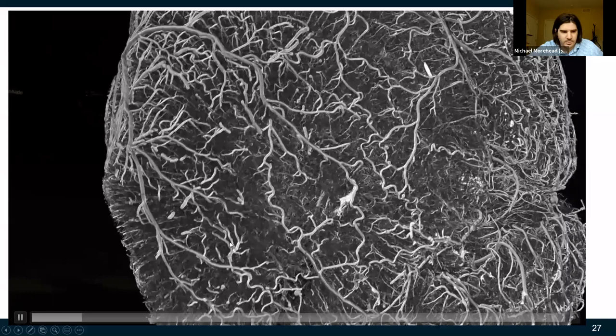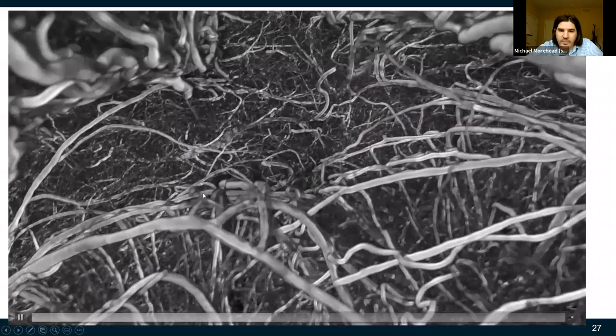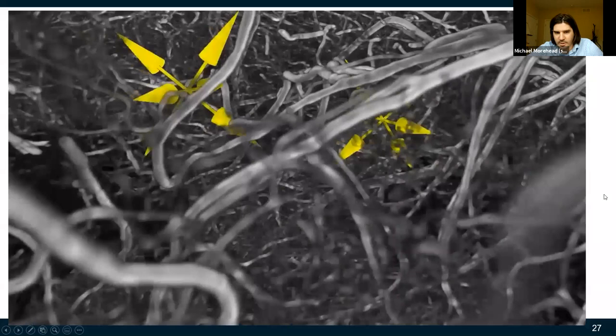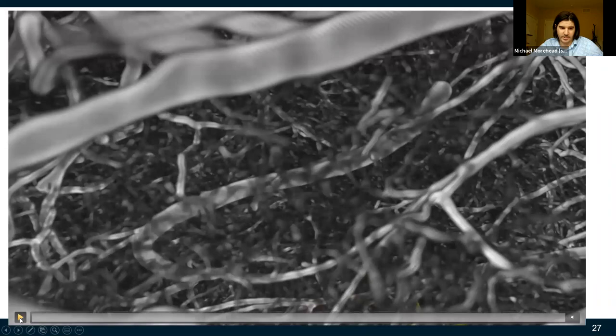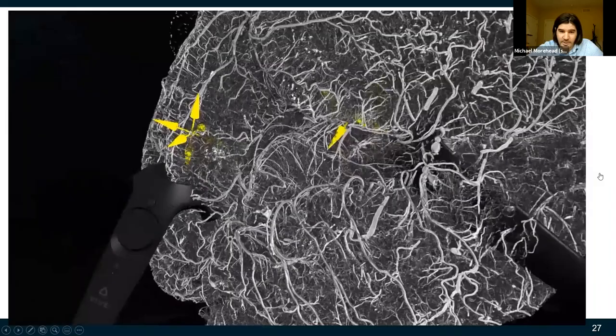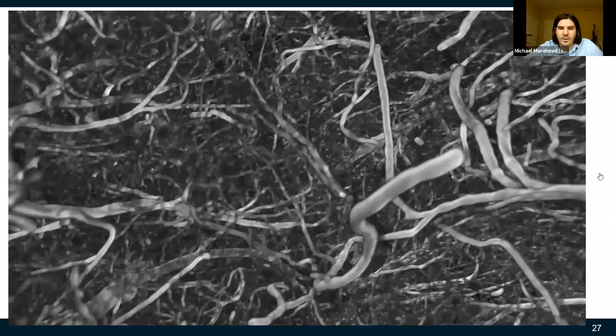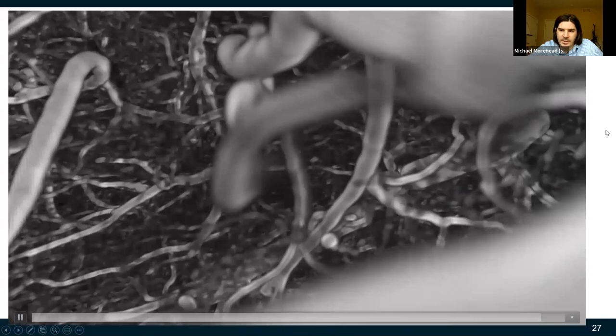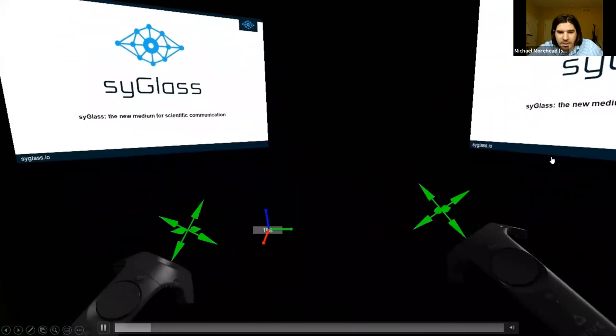Here's the micro CT of every blood vessel in the mouse's brain shown in Syg lass — about a 100 gigabyte dataset. You can seamlessly walk through it. The spatial understanding from seeing it this way is so much richer than seeing it in 2D.